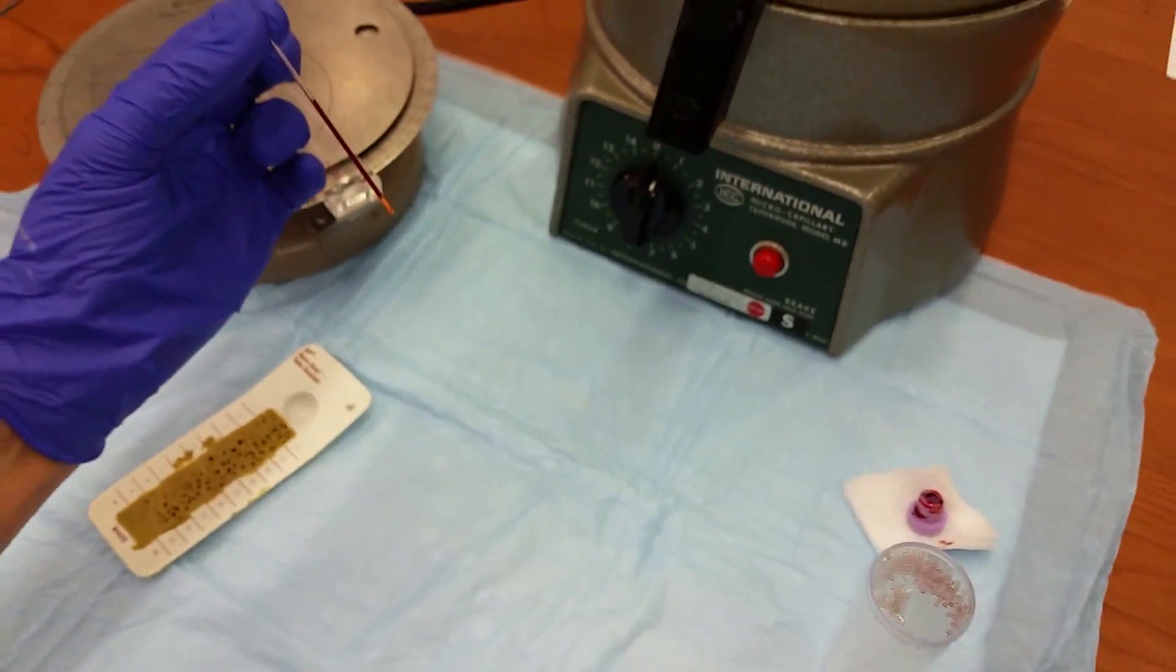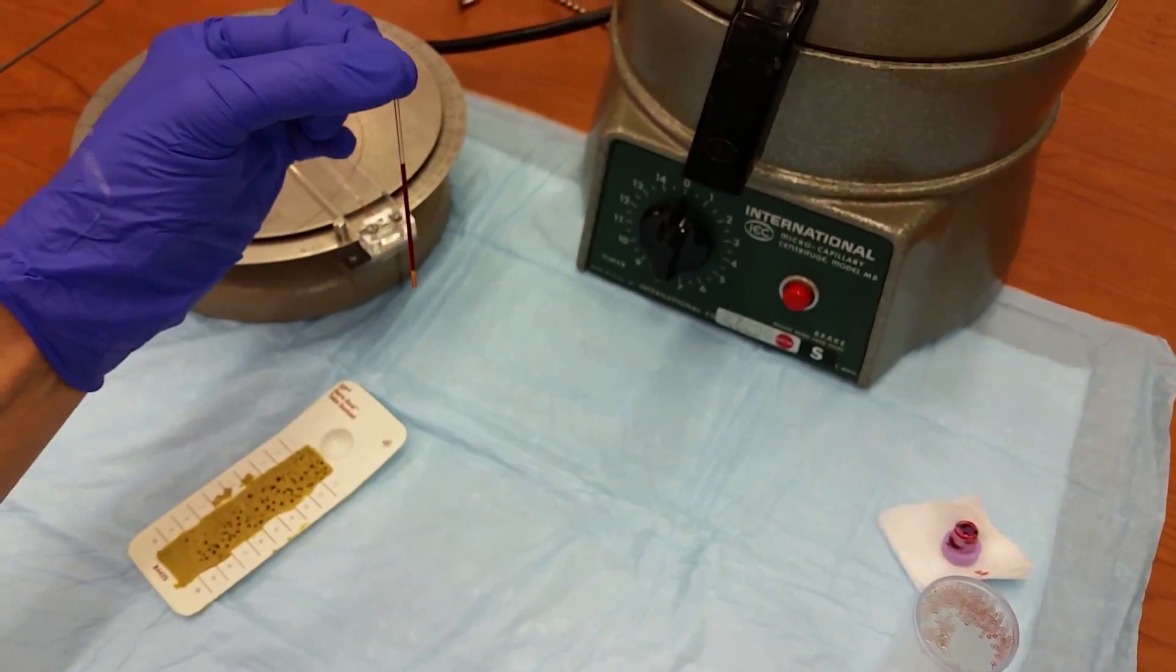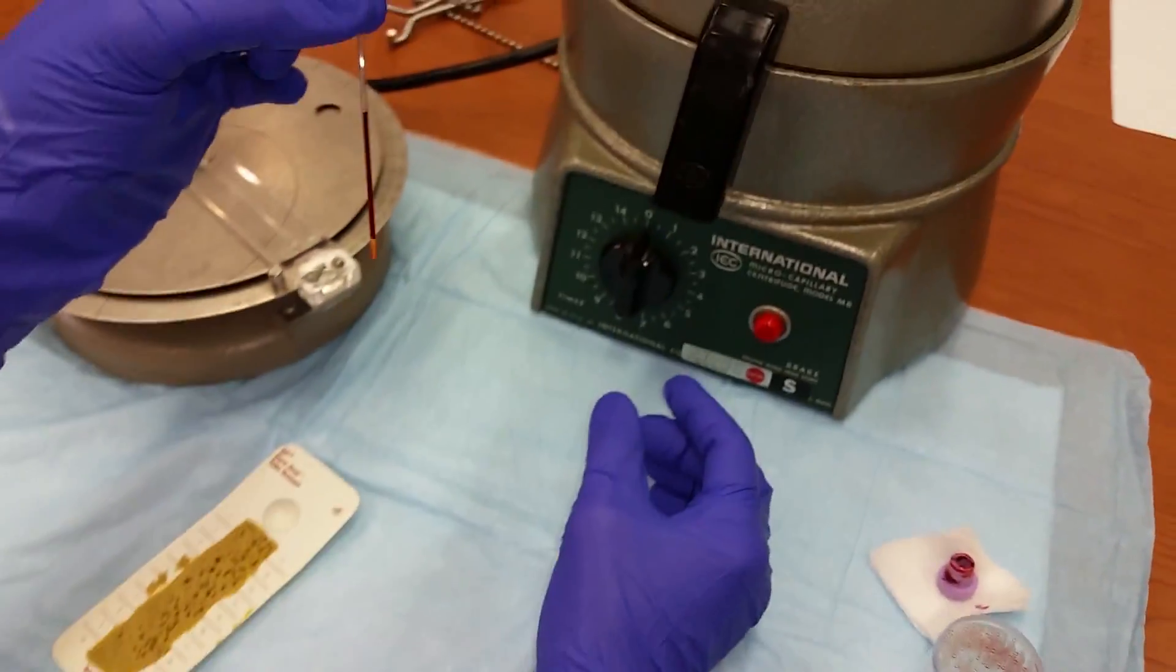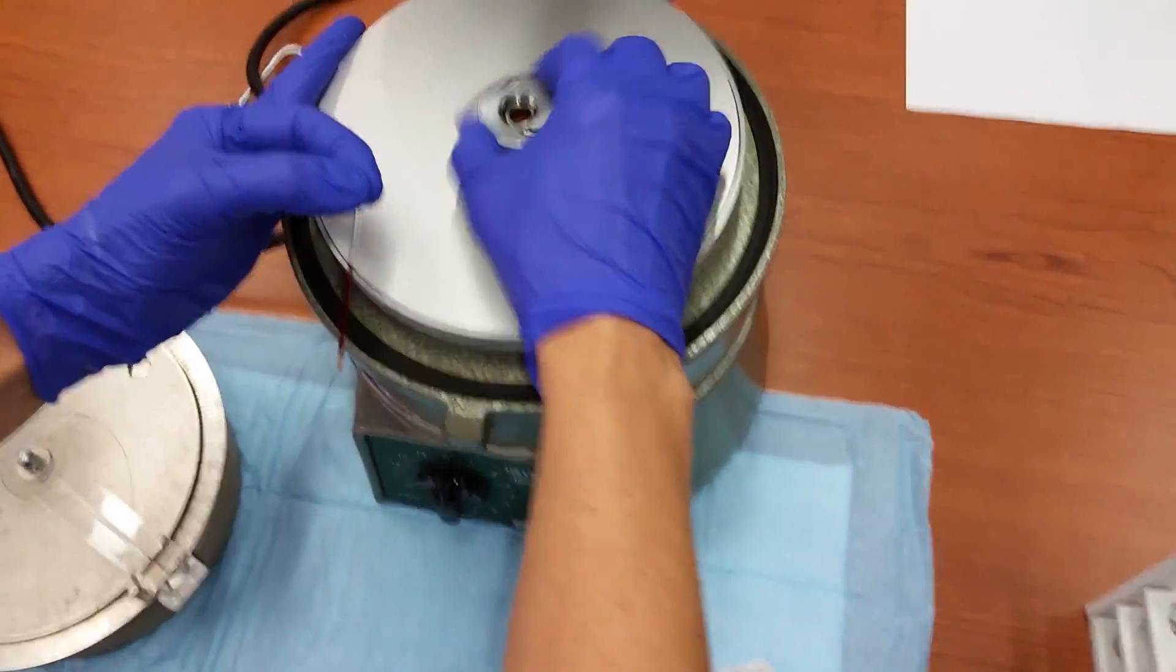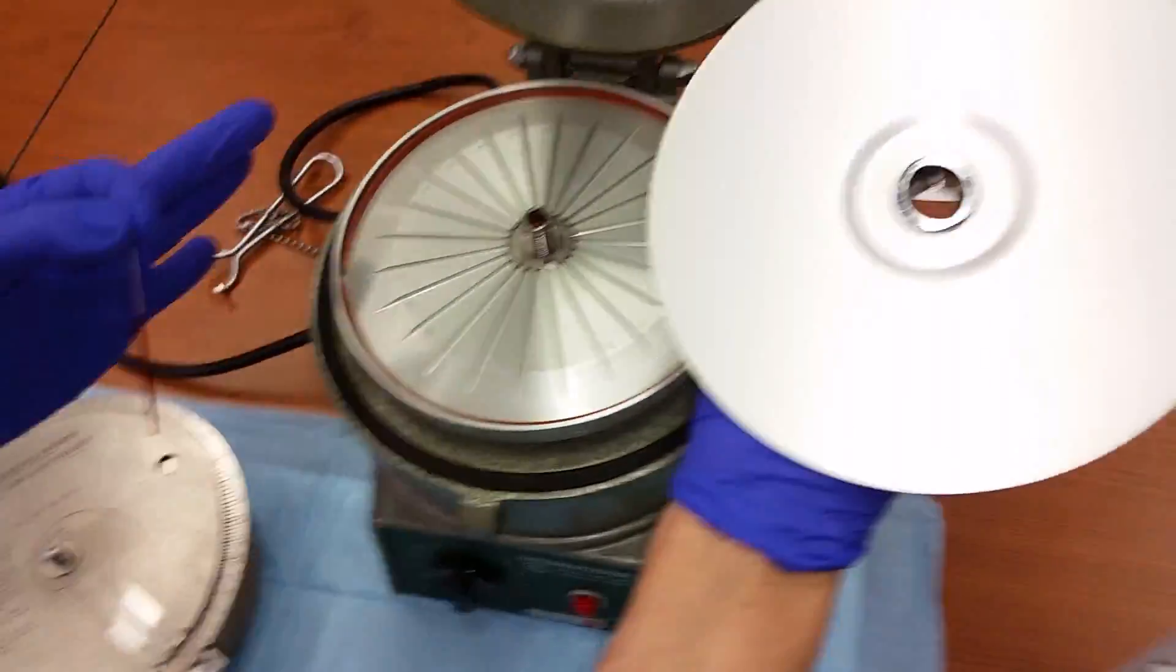We're then going to spin the capillary tube in a microcentrifuge. You first need to remove the top of the centrifuge.